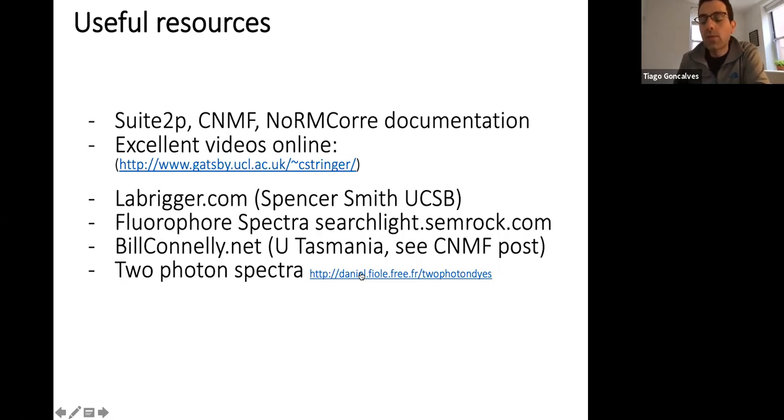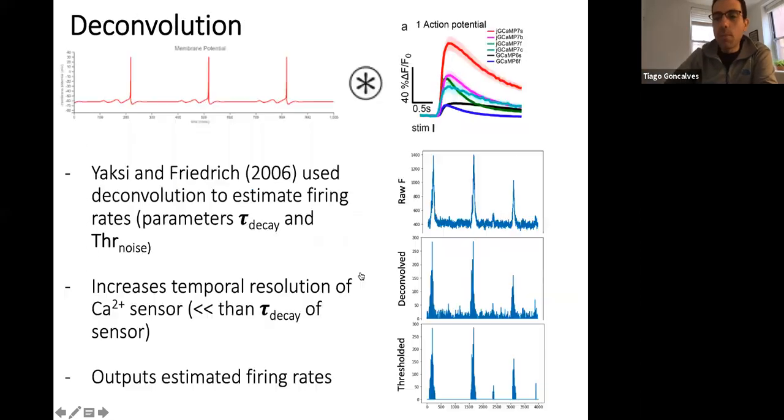There are different ways of solving this problem, which is the fact that your cell may not be visible with GCaMP, because GCaMPs were developed to have the maximum possible delta F over F, meaning the maximum possible transient. And one way that they did this was by decreasing the baseline fluorescence to a minimum. So these things are really, really dark unless the cell is active. And that can be a problem. For example, if you're trying to find ROIs, anything that is not based on a cell, detecting a cell that is active, that can be problematic.